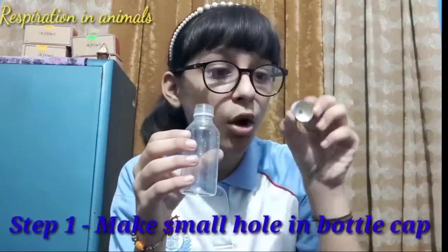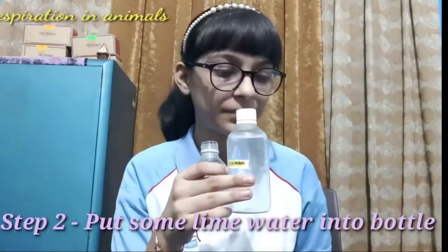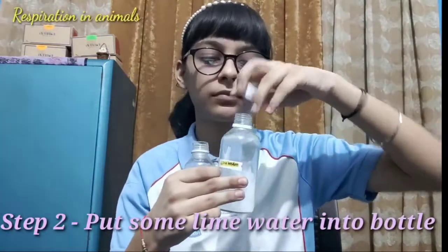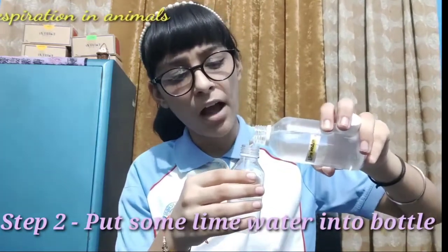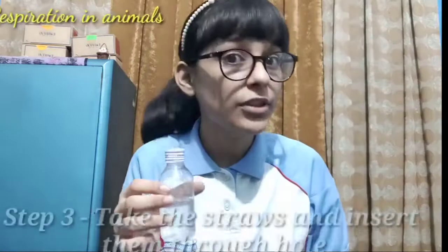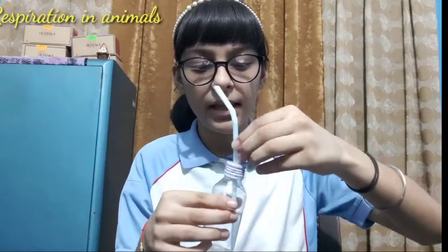First, make a small hole into the bottle's cap. Secondly, put some lime water into this bottle. Now put the bottle's cap. After putting the cap on the bottle, take the straw such that one of the straws dips into the water and the second straw does not dip inside the water.